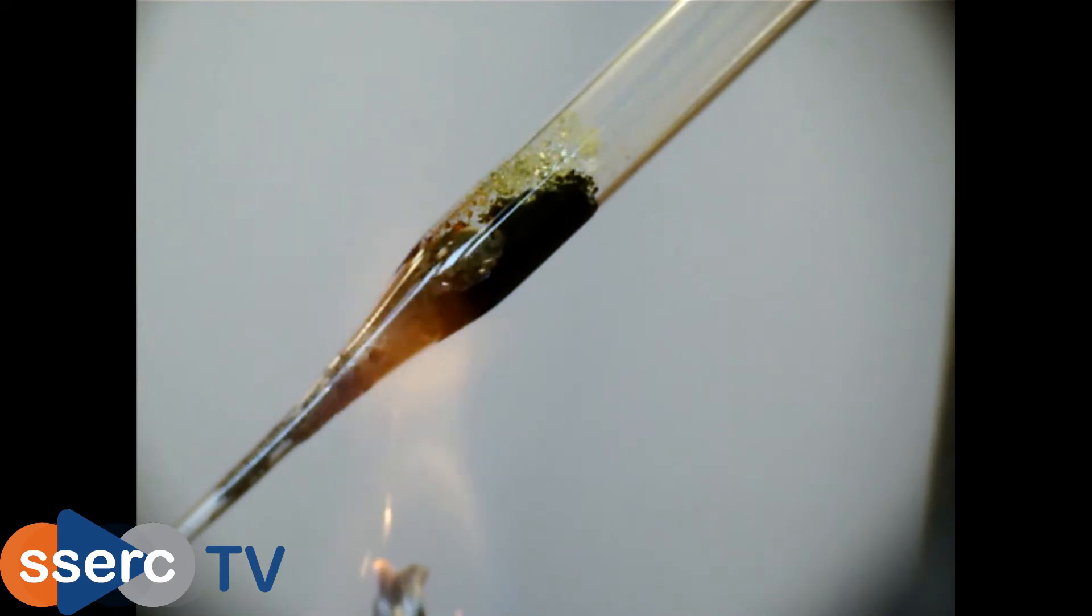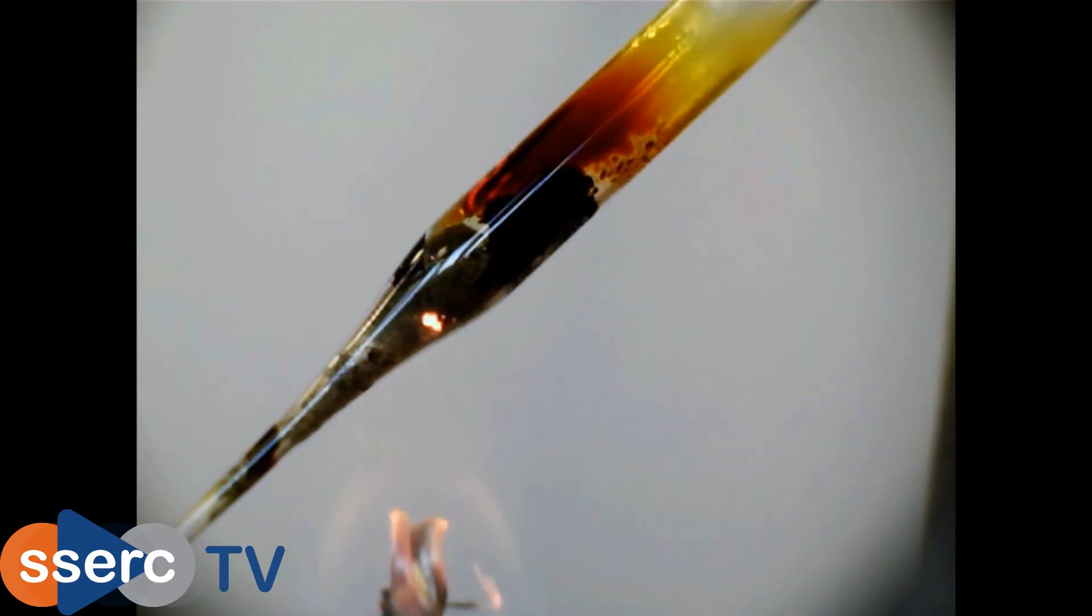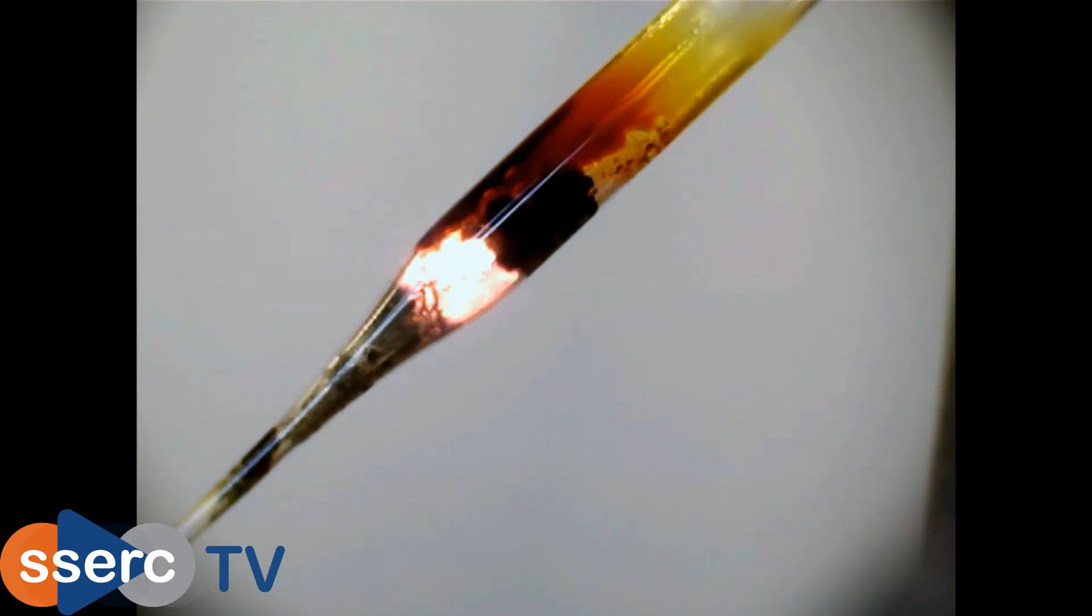Then you see a sudden glow that not only persists when the heat is removed but continues and works its way up the tube. The reaction once it starts is exothermic and you can see the heat being given off.